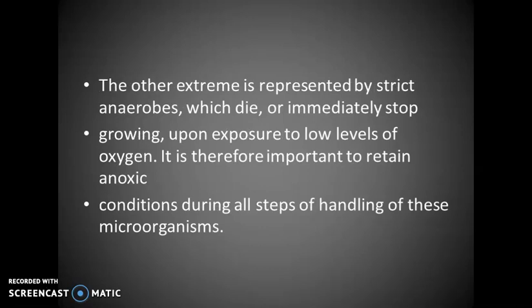The other extreme is represented by strict anaerobes, which die or immediately stop growing when they are exposed to low levels of oxygen. It is therefore important to retain anoxic conditions during all steps of handling these types of microorganisms.